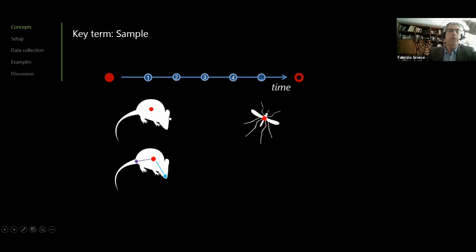You can view a sample like a box, like a container, which contains a number of features, depending on your setup. The same for a fish. For instance, if you track a fish, you want to track the nose, the snout, the center, and the tail base. If you have a social interaction test, then you have 2 animals, for instance.